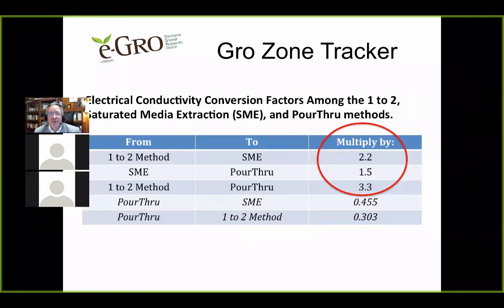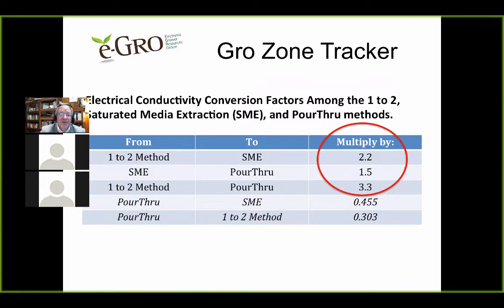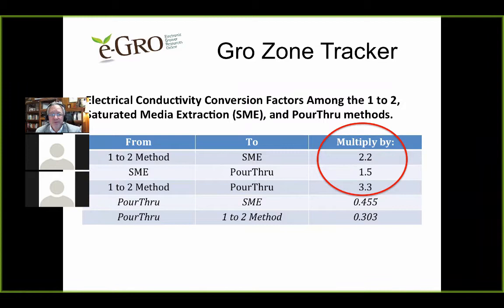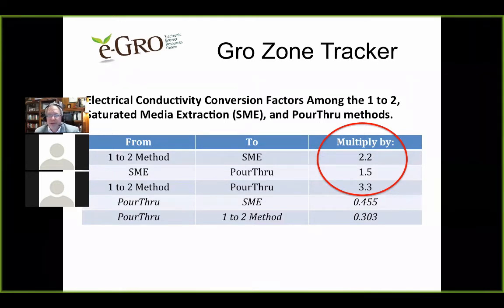If you need to convert values from the 1:2 method to pour through, here are conversion factors. We would not typically convert by multiplying by 2.2. To go from the 1:2 method to pour through, the standard conversion factor is multiplying values by 3.3. That gives you values you can then plot against pour-through standards. Unfortunately, the app doesn't yet accommodate SME or 1:2 method directly.